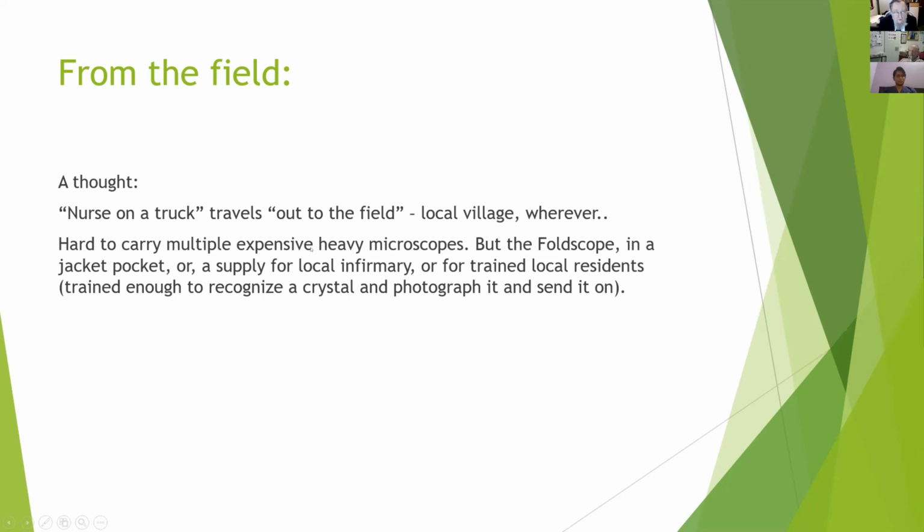It's hard to carry multiple expensive heavy microscopes, but with the Foldscope in the jacket pocket, or a box full for the local infirmary, you can even train the local residents, meaning people who live there, enough to recognize a crystal and photograph it and send it on, so you have the capability of diagnosis at a distance.